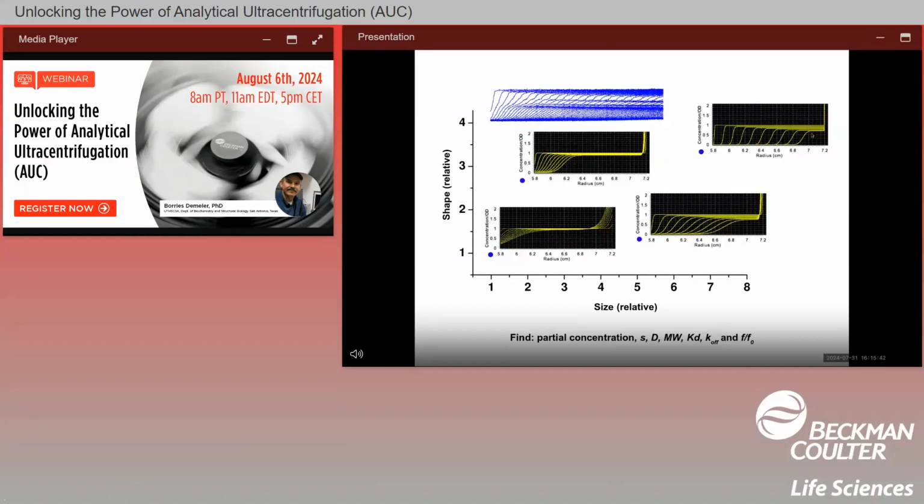So there we would see these kinds of boundaries that are far apart, and they wouldn't diffuse very quickly and become shallow like here. They would stay more steep. And then, of course, we can have all kinds of things in between. And the task that we have is to find out which type of boundary is present in our mixture, and then how much of each do we have. So the relative amount of each spot in this plot is what we're after.